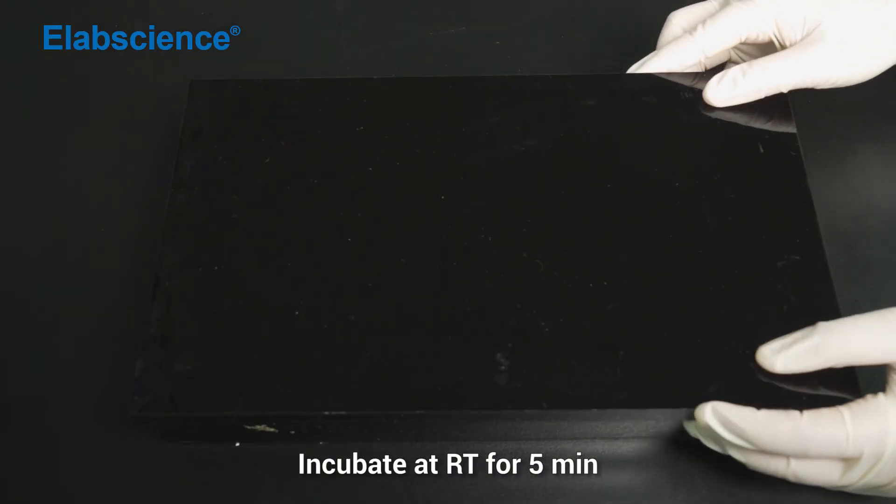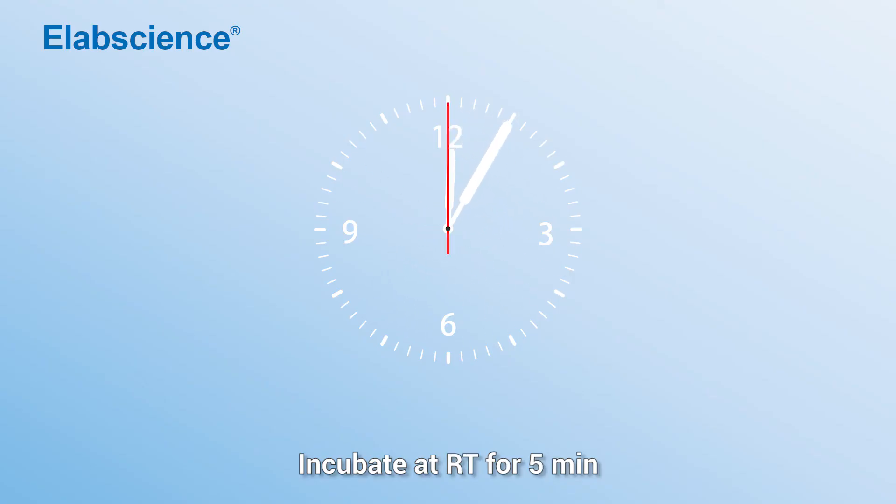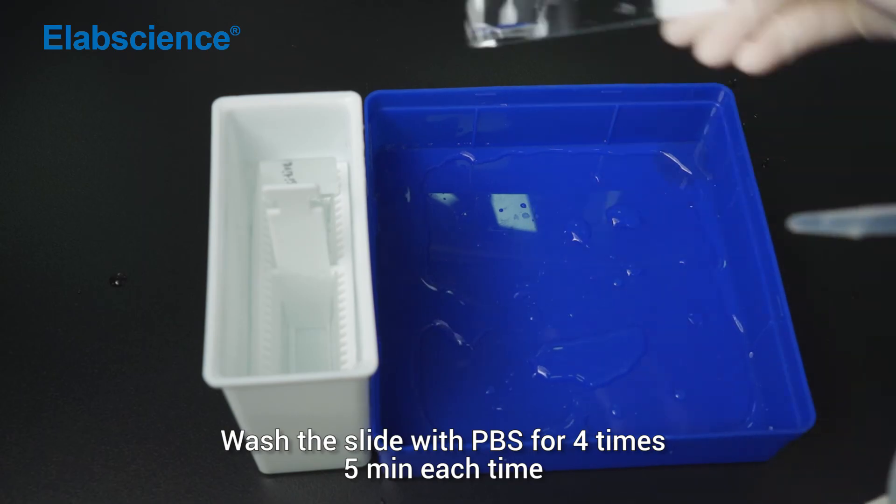Incubate at room temperature for 5 minutes. Wash the slide with PBS for 3 times.